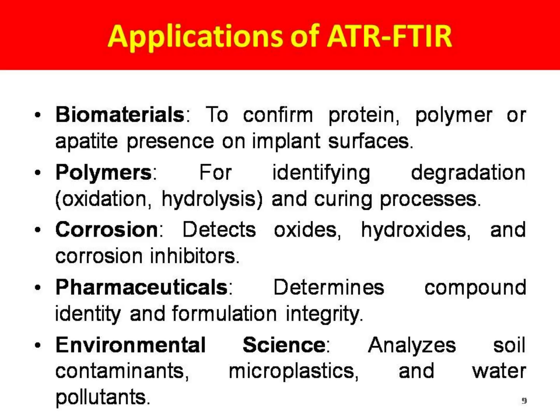And it is also used in the field of corrosion, that is to detect oxides, hydroxides and corrosion inhibitors. It is also used in pharmaceuticals, like determination of compound identity and formulation integrity.